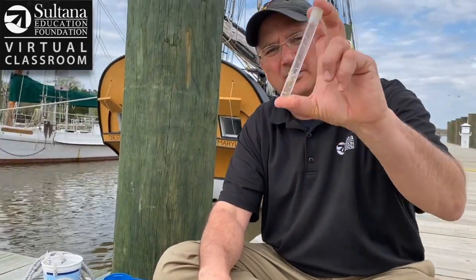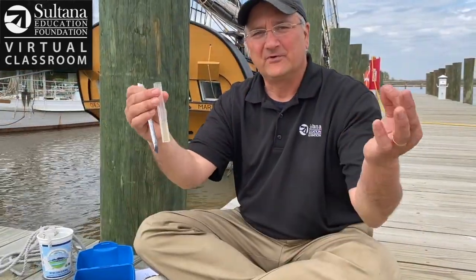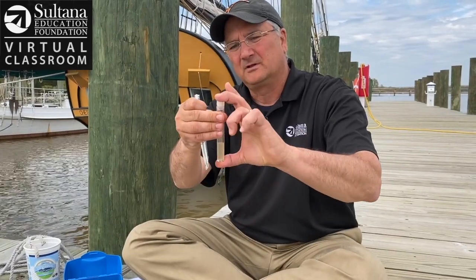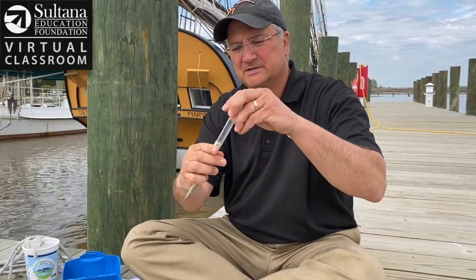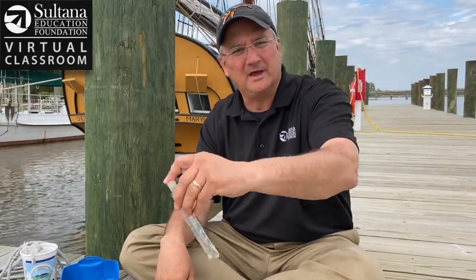These tablets will turn the water a shade of pink. My first tablet has dissolved, now I put a second tablet in the vial, close it up, and put it in this sleeve. I'm going to shake it up and let this sit for about five minutes and we'll see what color we get when it emerges.